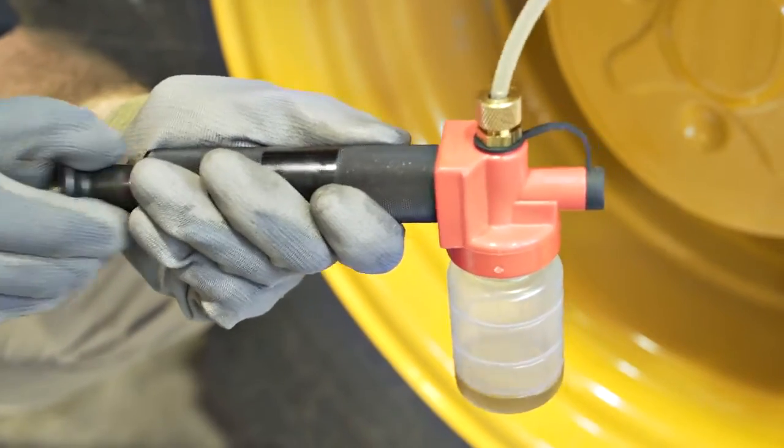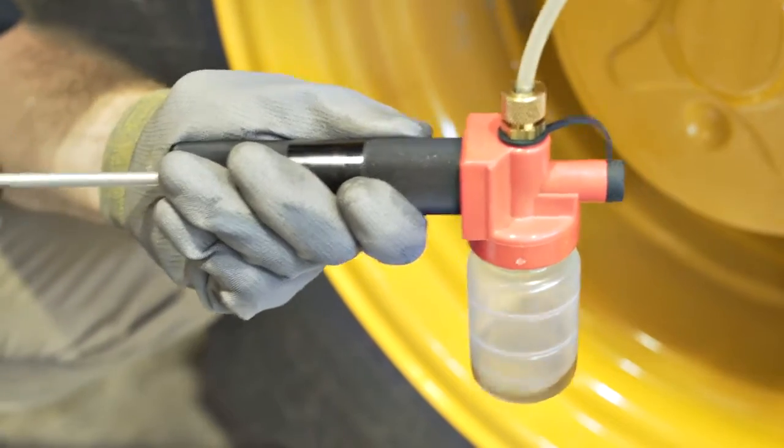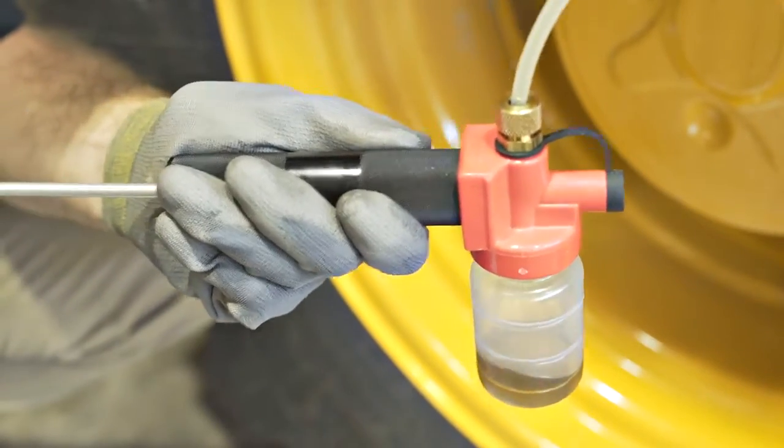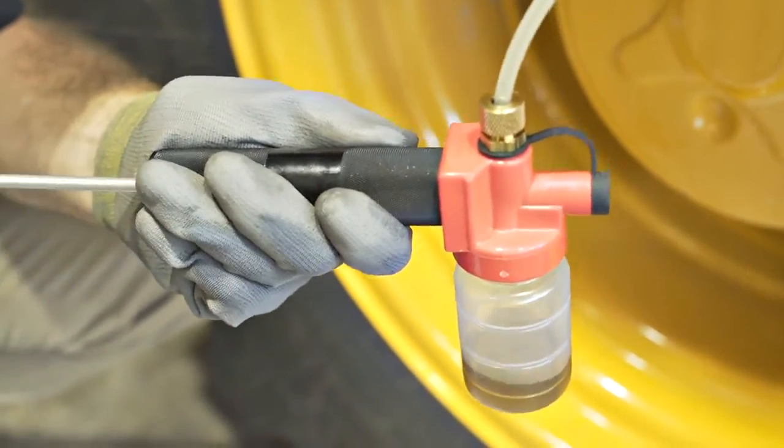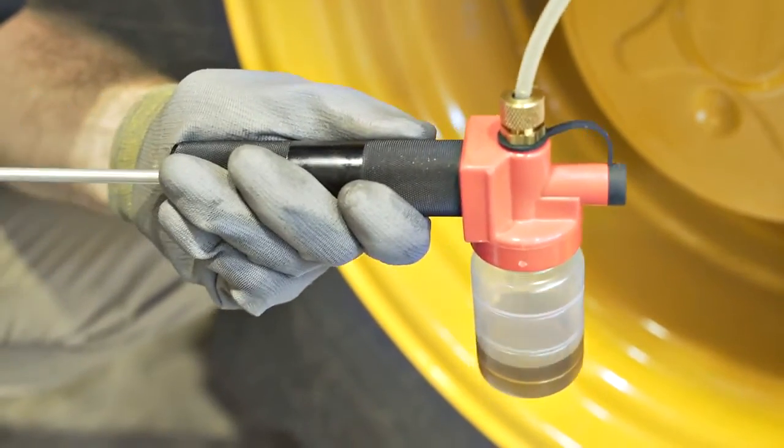Sample stationary equipment during normal operating conditions in return lines or downstream of pumps, cylinders, bearings, and gearboxes, and upstream from the filter.